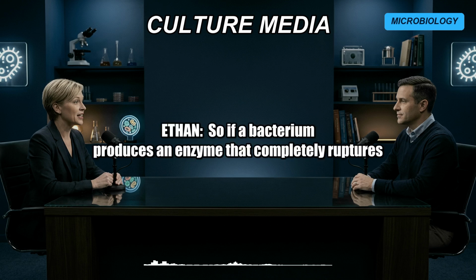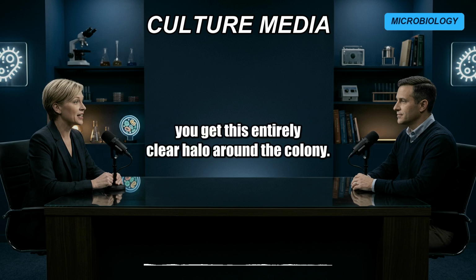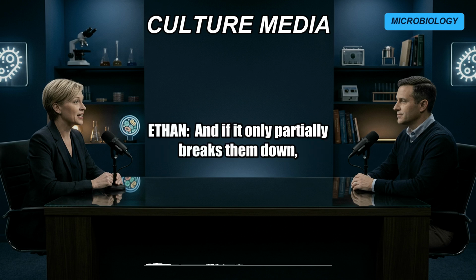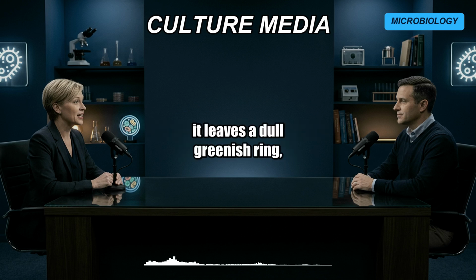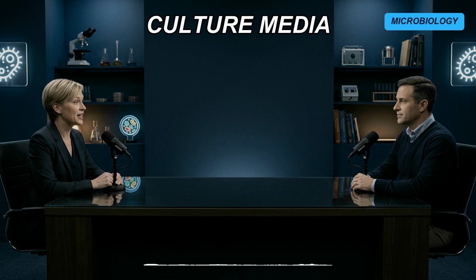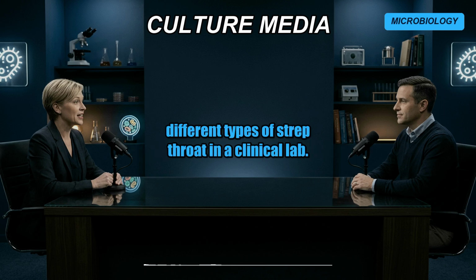So if a bacterium produces an enzyme that completely ruptures the red blood cells, you get this entirely clear halo around the colony. Right. That's beta hemolysis. And if it only partially breaks them down, oxidizing the hemoglobin, it leaves a dull greenish ring, which is alpha hemolysis. Exactly. And if the blood is untouched, that's gamma hemolysis. That single visual cue is a massive shortcut for identifying different types of strep throat in a clinical lab.